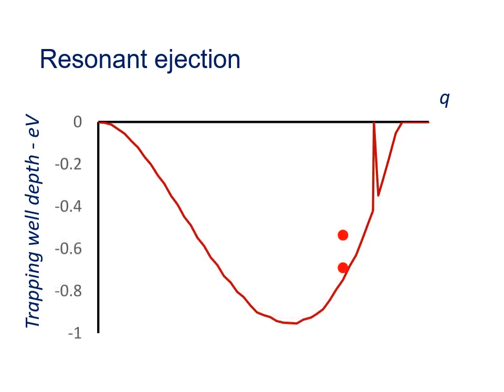But when we add our resonant ejection tickle signal onto our ion trap, either the end caps in a quadrupole ion trap or the X rods in a linear ion trap, the trapping well depth profile changes to look like this. This sharp loss of the trapping well depth is a result of the resonant excitation of ions at that value of Q. And because it has such sharp edges, that's why all the ions of a given mass to charge ratio will be ejected from the ion trap at approximately the same time, irrespective of their energy spread.